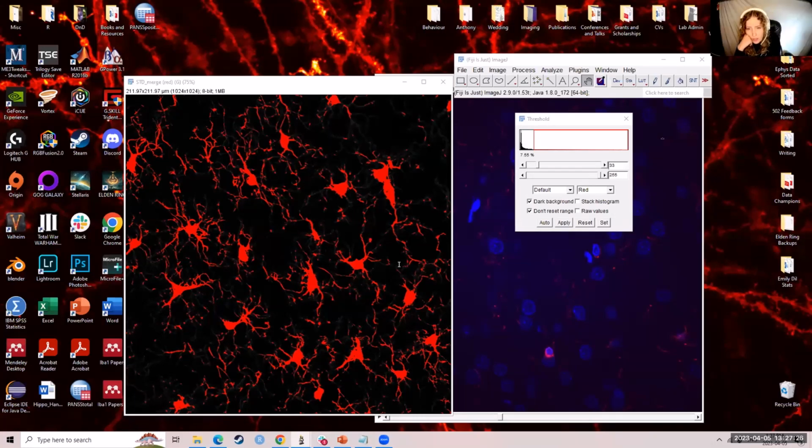From a best practice and ethics standpoint, is it acceptable to blur the image with a Gaussian filter before thresholding just so the binarized image ends up cleaner? I would have to refer you to Mickey from part 1 on the ethics. I think she's the expert with that. What I would say is anything you do that's for publication, you have to tell people what you do. So if you do that, put it in the workflow and state that that's what you did and have a methods figure with an example of why you did it and why it looks that way.